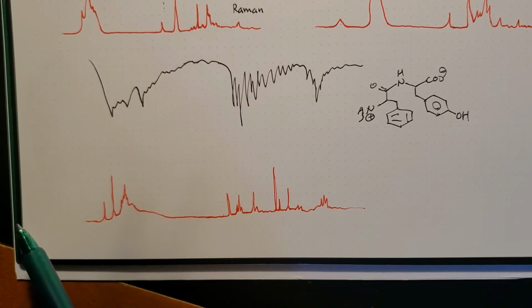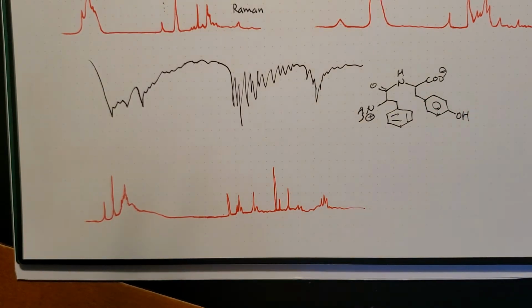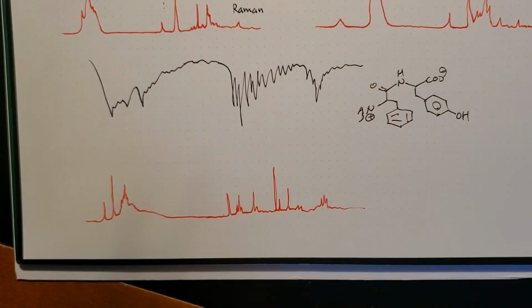And if you think about a multi-oligomeric peptide chain, it will be much busier. So for an IR study, it's very difficult to keep track of what's happening to the functional groups, or say this particular ring is interacting with the enzyme or something. You cannot see the changes easily.